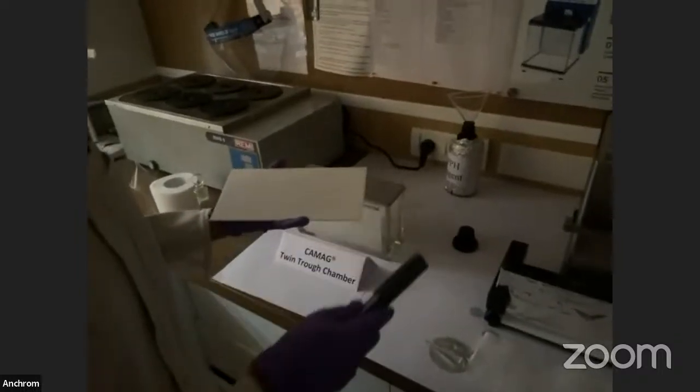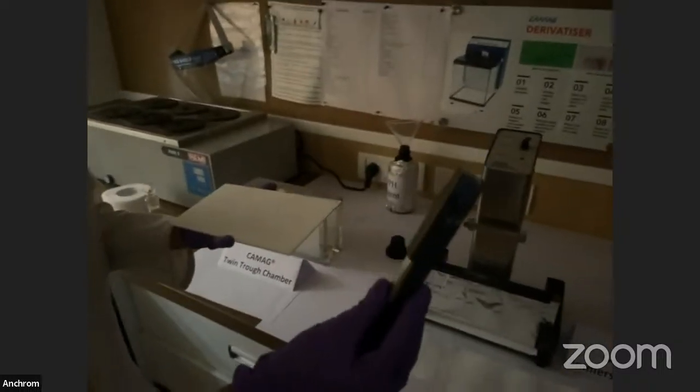So I have poured my reagent into the dipping chamber. Now with this clamp, I will hang my stationary phase.